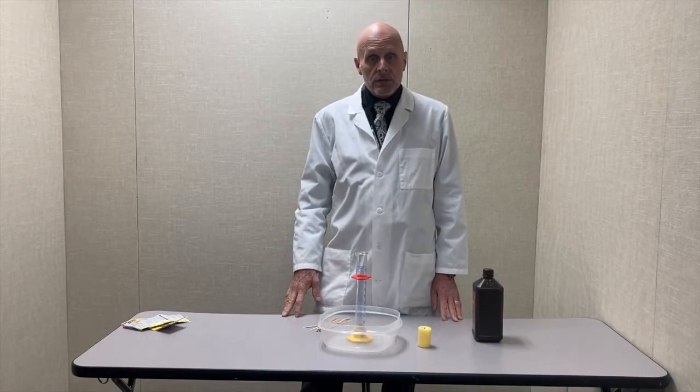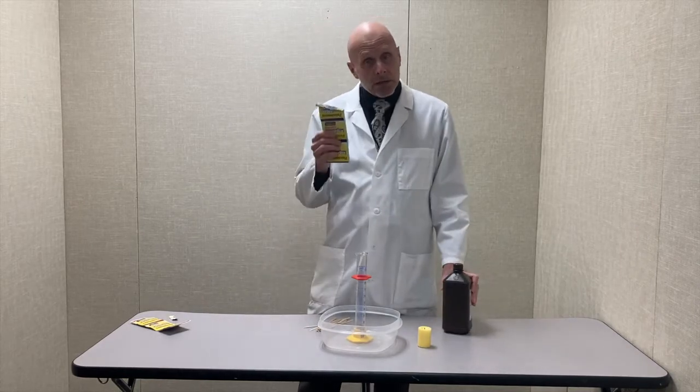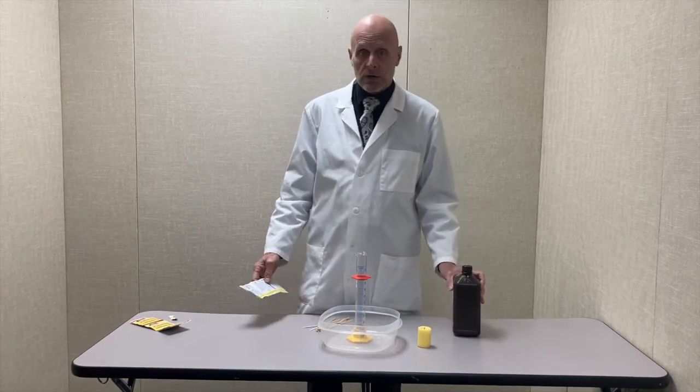Hello, teachers and students. In this experiment, I'm going to mix a solid and a liquid. The solid is yeast that we use in baking, and the liquid is hydrogen peroxide.